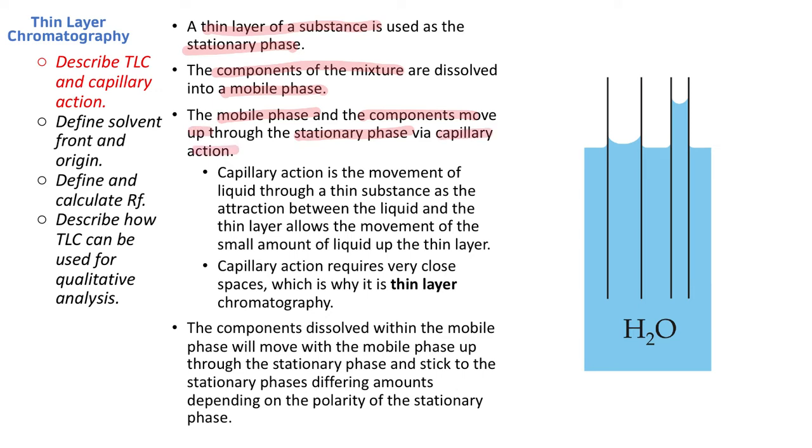So what is capillary action? Capillary action is the movement of a liquid through a thin substance, as the attraction between the liquid and the thin layer allows the movement of a small amount of liquid up the thin layer. All right, so what does that mean?